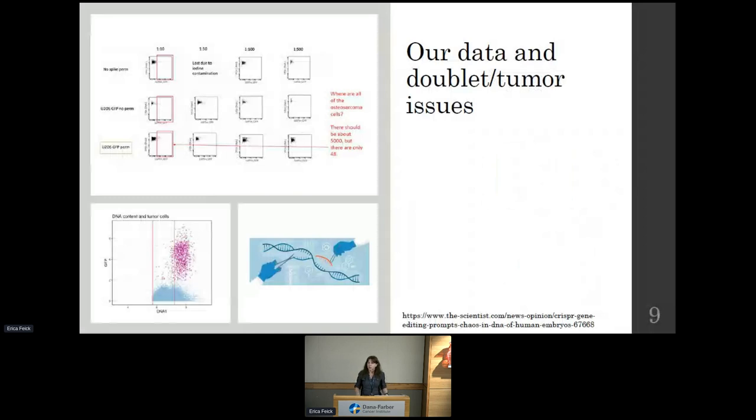She said, "I should have 5,000. I know I have 5,000, but there are 48 left in my data set. I don't know what's happening." Well, she backed up and undid her gating and found that she was gating them all out when gating out doublets. So in that bottom left-hand diagram, that's the actual data set you're seeing where they had all disappeared.